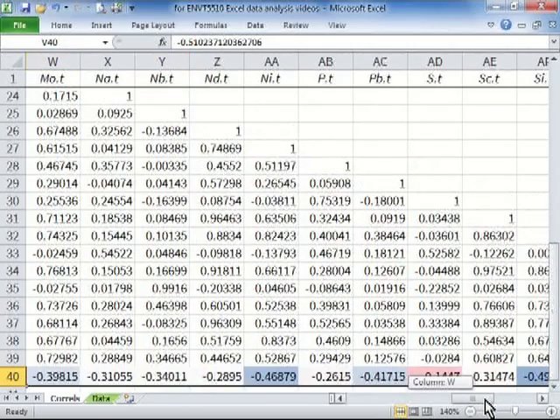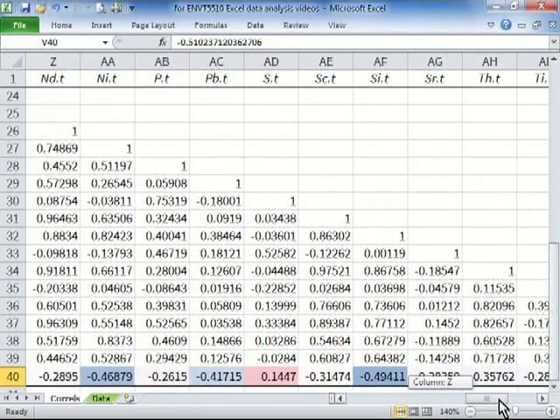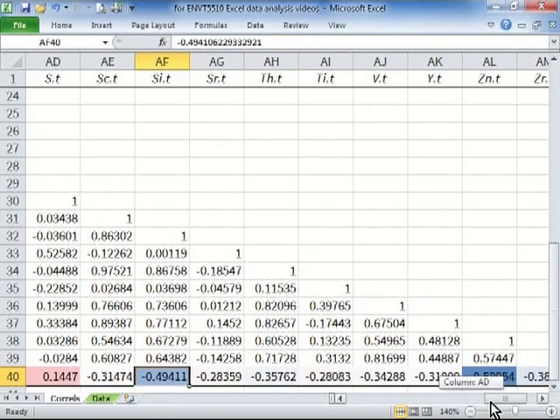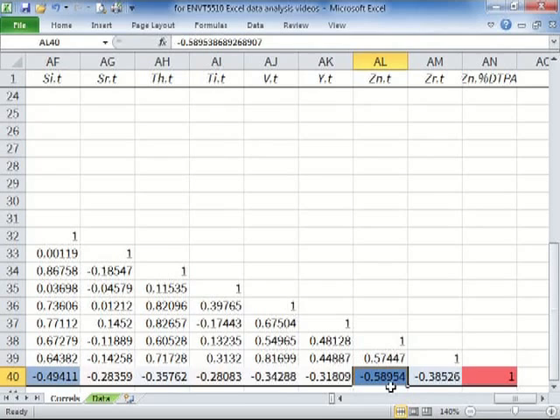What else have we got in terms of major elements? Silicon. Okay, so that's unusual. That means there's more silicon, which can mean a sandier soil, and also total zinc. So total zinc should have an influence on the amount extractable by DTPA.